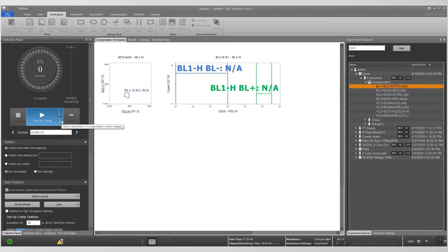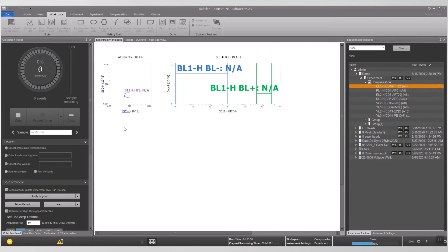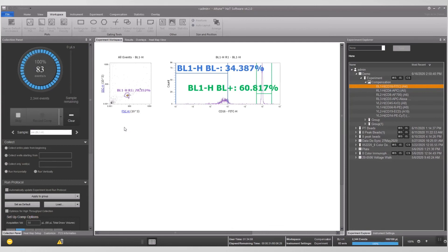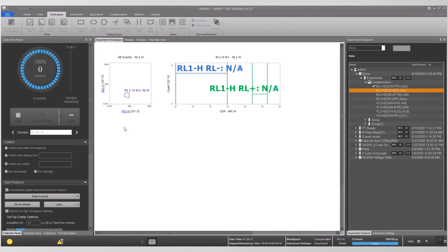In the control panel, change from setup mode to record by clicking on the drop-down menu. Click record and the plate will automatically switch to the next well and record the compensation controls. After the well is recorded, a check mark appears next to the sample name.